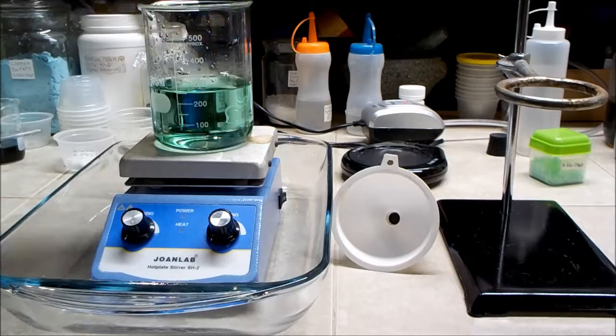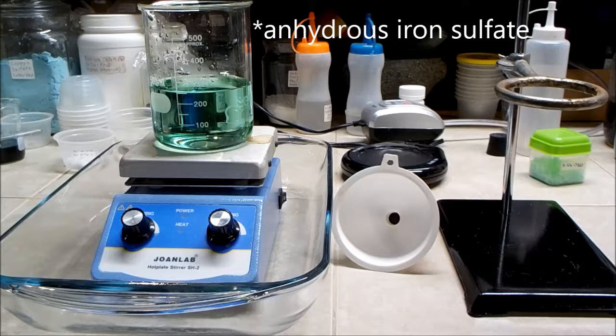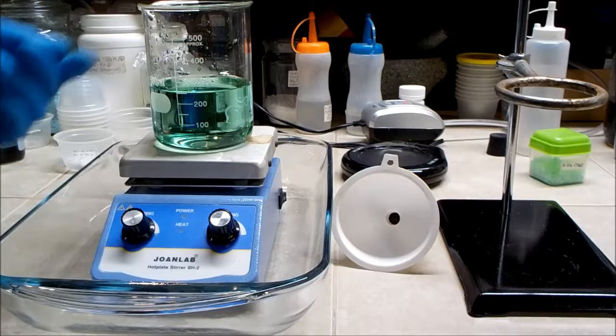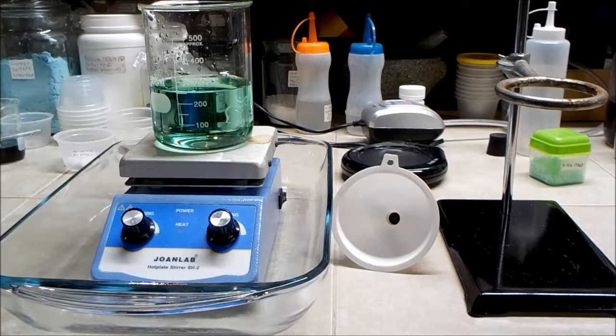theoretical amount that I should have is about 60 grams of the iron sulfate, and checking the solubility, it should require about 200 milliliters to get it down to the saturation. And I want to go below that so the crystals will form. So I'll probably go down to about 150 milliliters and then let it cool down and the crystals should form.